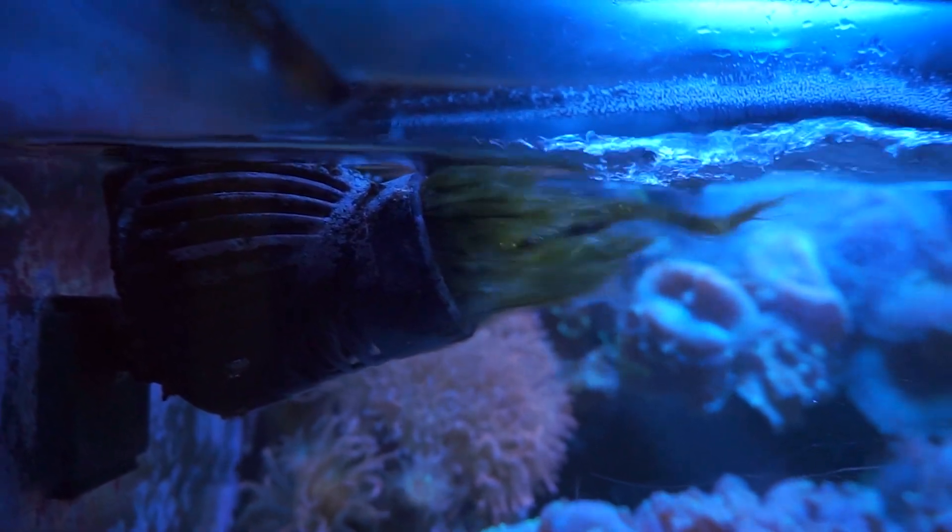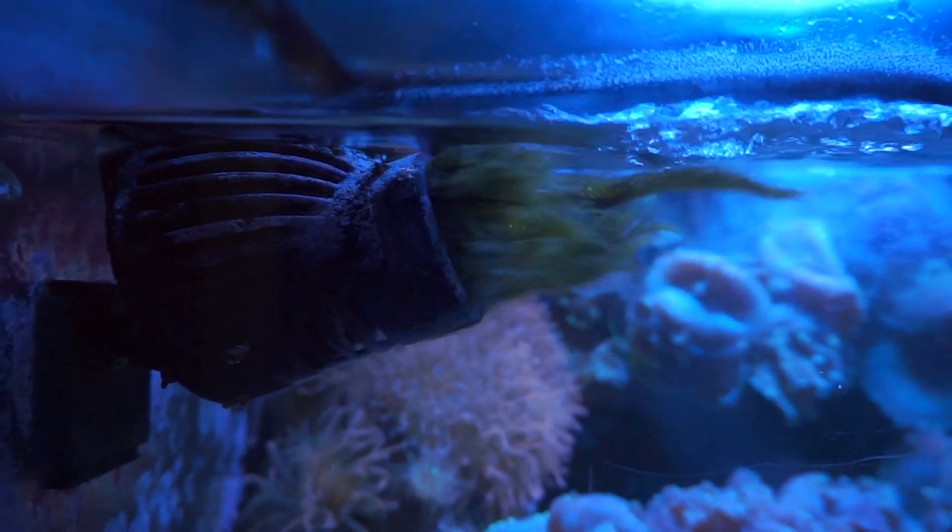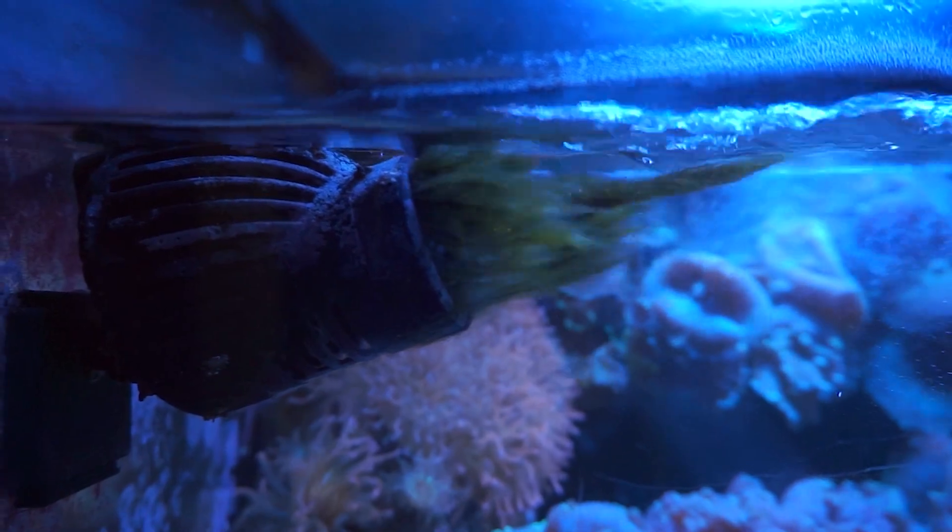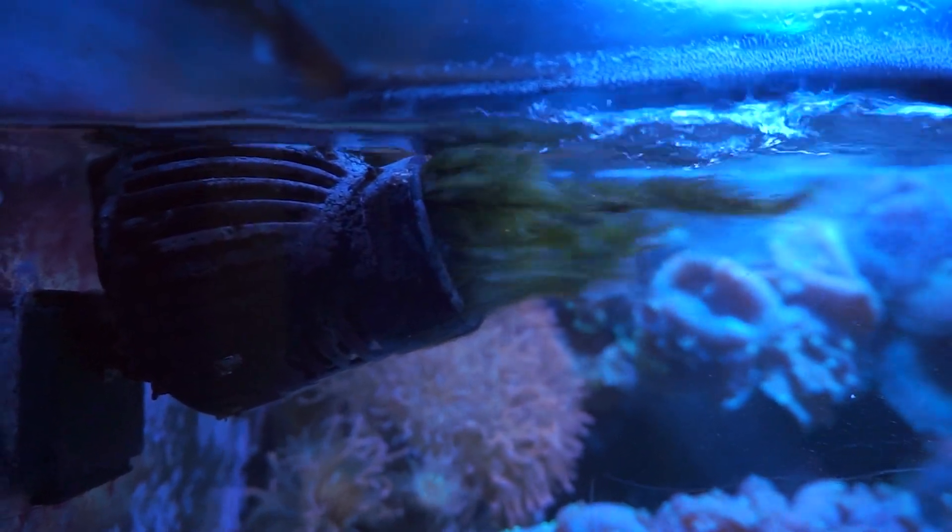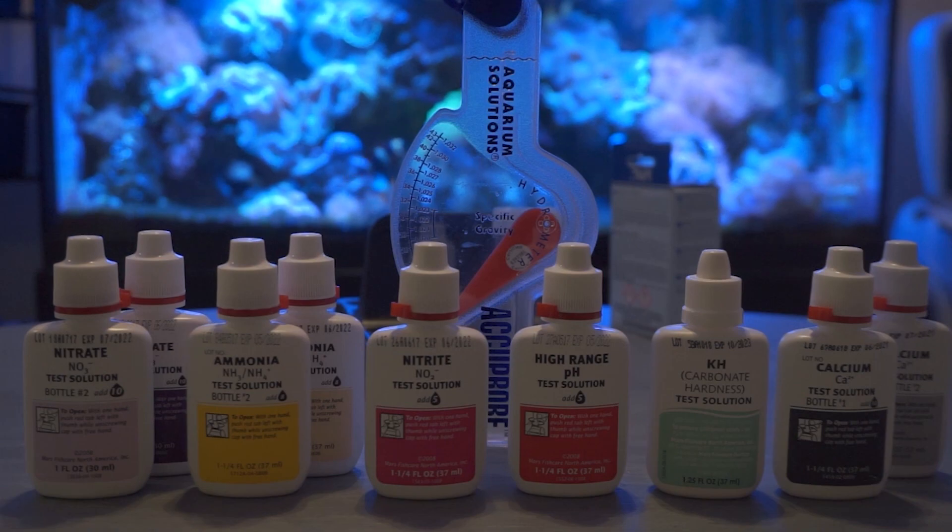Today we're actually going to be looking at the API master test kit which comes with our four main ones. We're going to have the ammonia test, the nitrate test, the nitrites, high range pH, and then also not included in the kit but bought separately we're going to test our calcium and our KH.